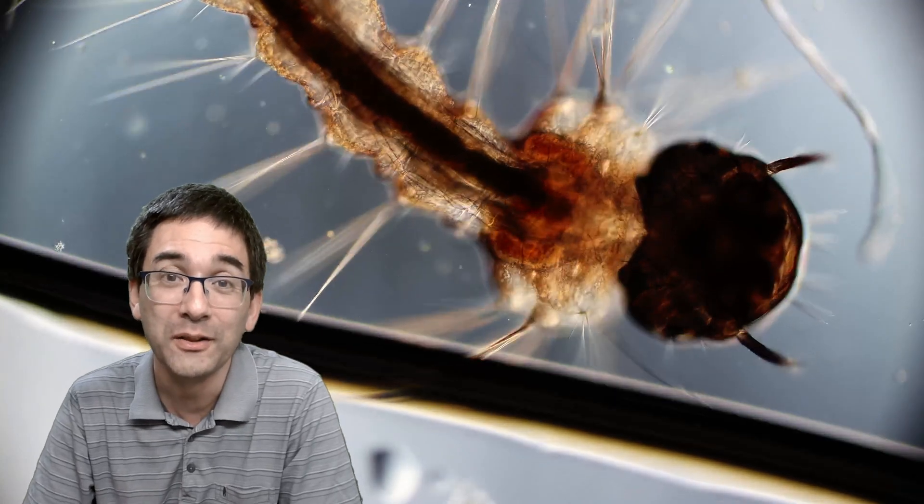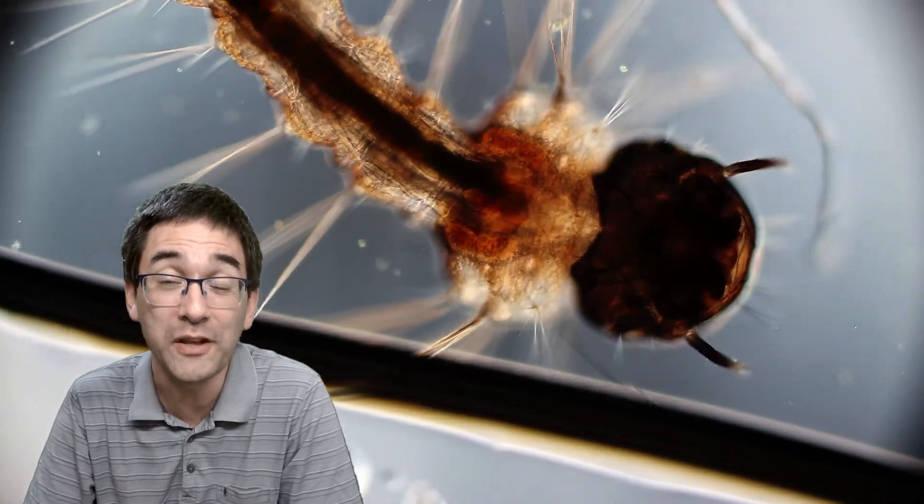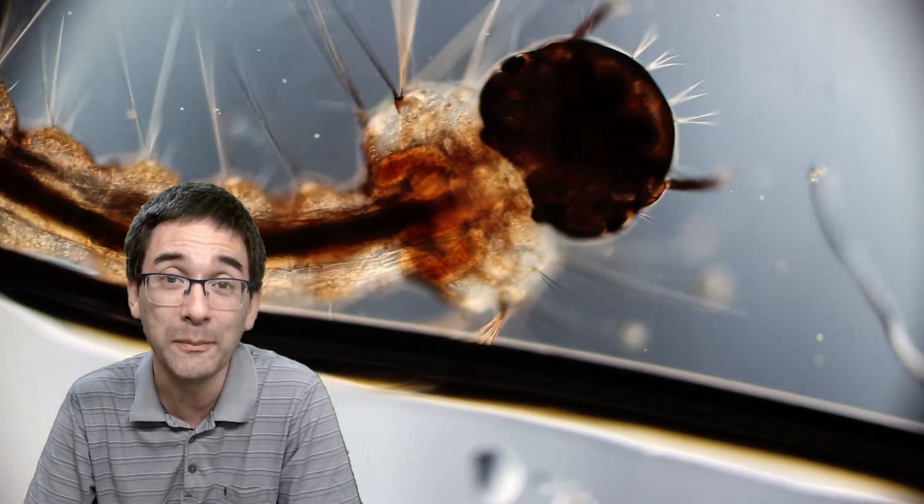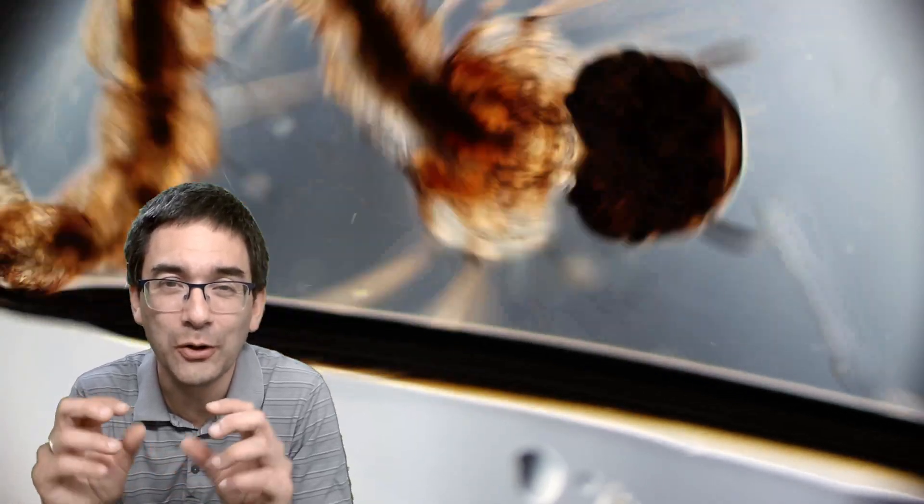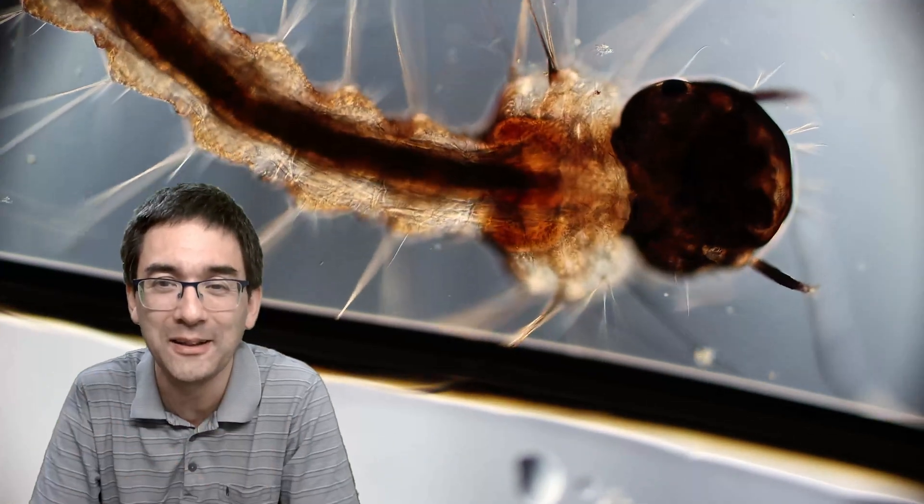Here you could just see the tail of the mosquito quite well. Those mosquitoes larvae also have a lot of hair around them, and you can also see that the head is pretty large and there are those two tiny antennae there as well.